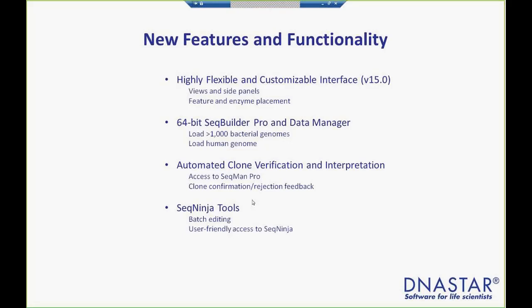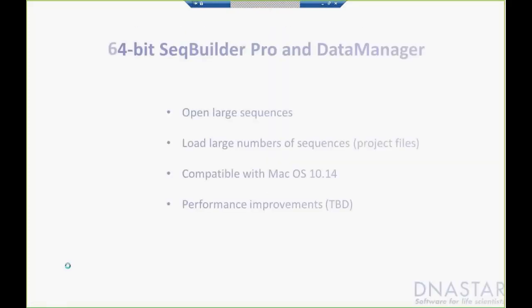We also have implemented some SeqNinja tools. So there's another application in our molecular biology suite that allows you to make scripts and do some automation on sets of sequences. And what we're doing now is making some of that more accessible to folks who aren't comfortable with scripting, and also make that power available through SeqBuilder. So if you have a set of sequences, you can do things like edit them in batch, or extract features, or concatenate, that sort of thing. And that's again giving you access to another tool through the SeqBuilder interface. And that's a trend that I think you'll continue to see from DNASTAR.